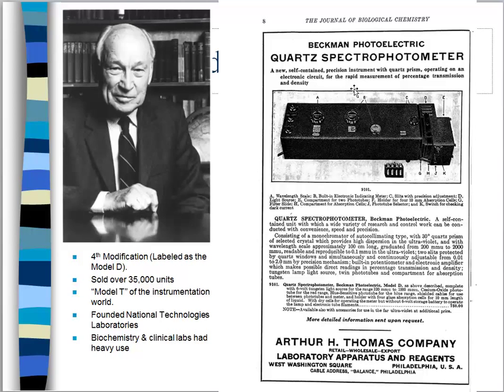So if you take a look at the advertisement, it says that this is a quartz spectrophotometer. Spectrophotometer is still used. Depending on the age of the person, some people will use spectrophotometer and other people drop the photo out of it and use spectrometer instead. They both mean really the same thing.